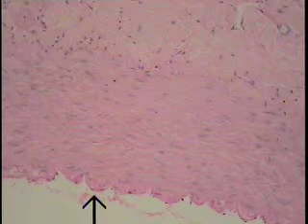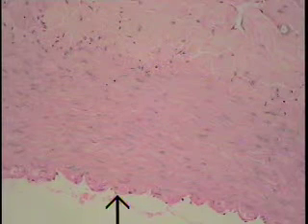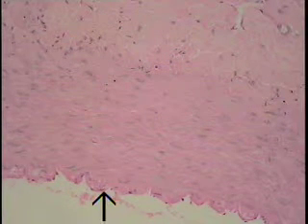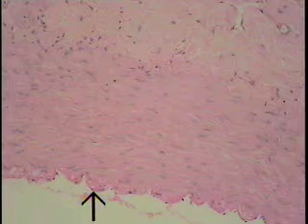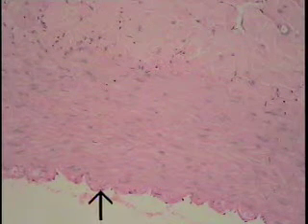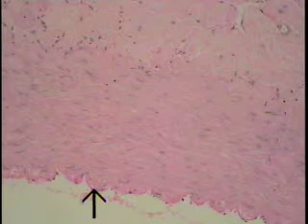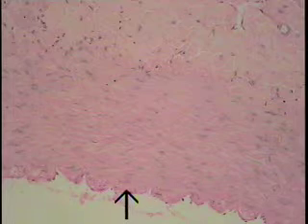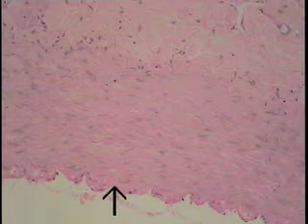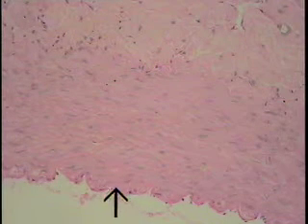Very quickly, the muscular artery seen at high magnification illustrates some of its features. The endothelial layer is shown right at the tip of the arrow. You can see the nuclei scattered along. Immediately subjacent to it is a very thin, light staining subendothelial connective tissue. Then one can barely make out the large scalloped internal elastic lamina shown here at the tip of the arrow.